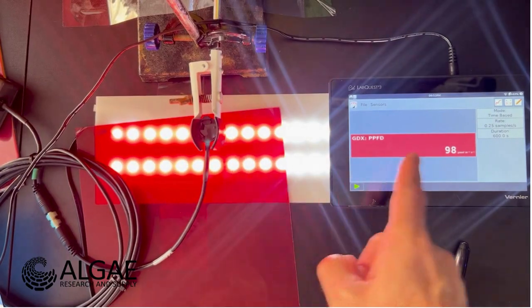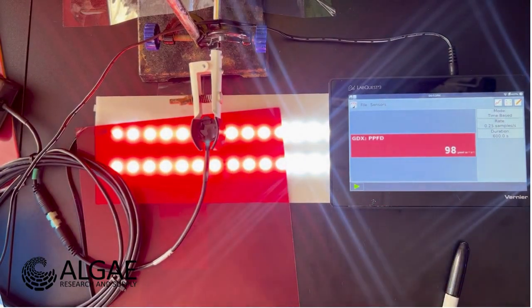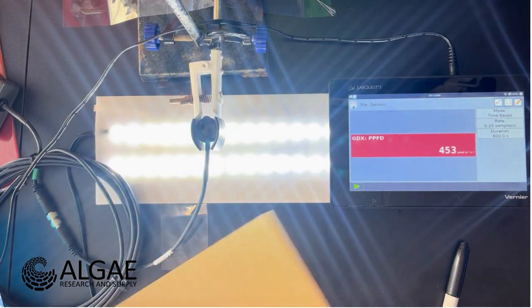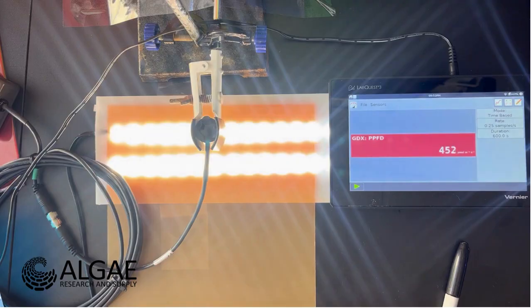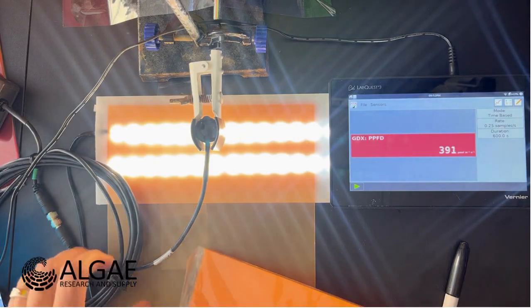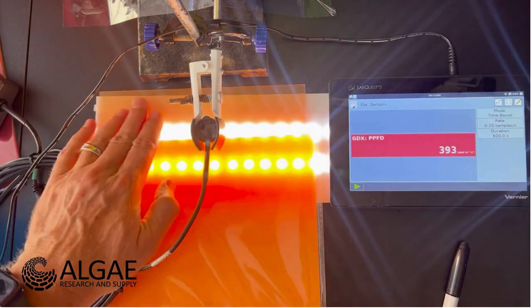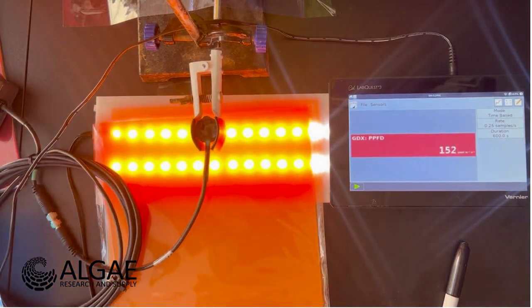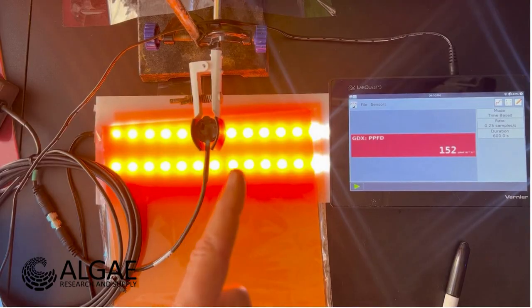Now we have the red here that's got roughly 100 micromoles. So I'm going to go to the orange next and see how many layers we need there. Here's the 1. However, I think that the whole pack probably needs to be there to make this one work right. So let's go with this. And that's going to get us to 152. We're going to come back to orange because this obviously needs a lot of layers to get to 100.